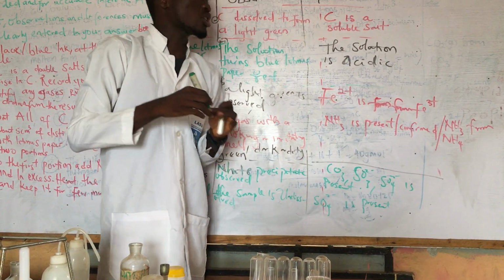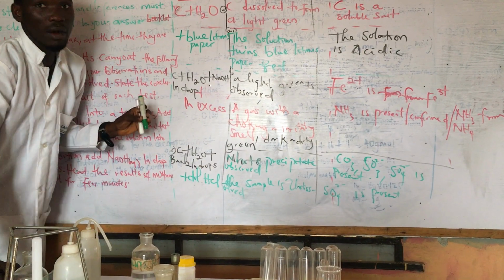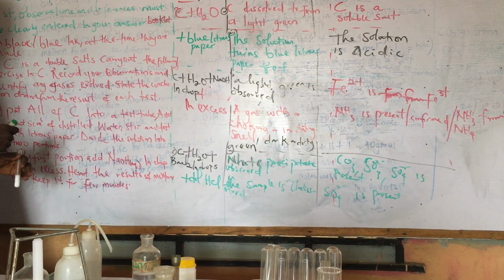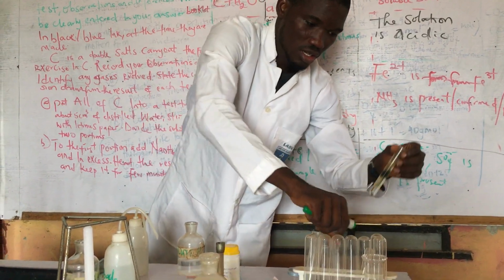So now let's go back to our sample C. I want to show you guys a particular thing there. I said it's the result of this now. So in excess, I still have it here.